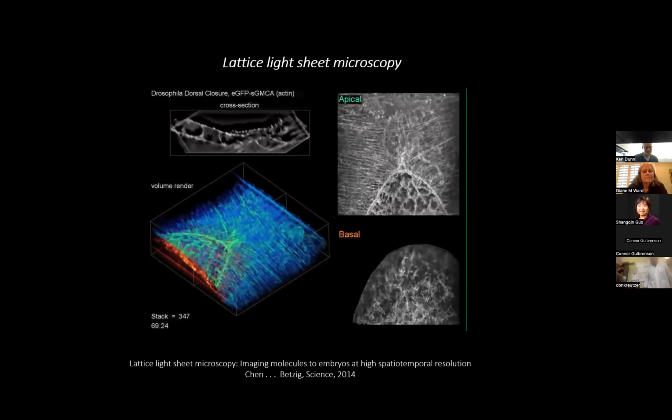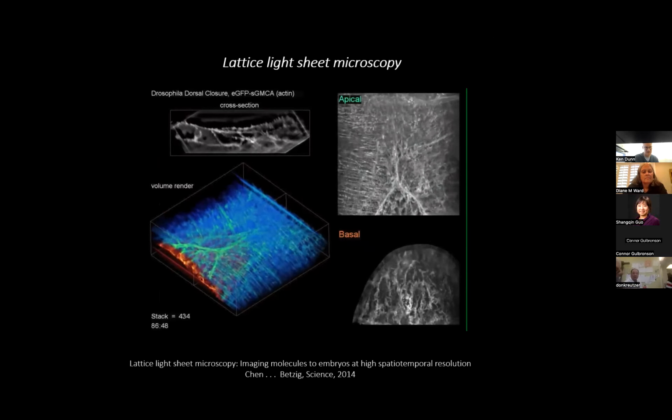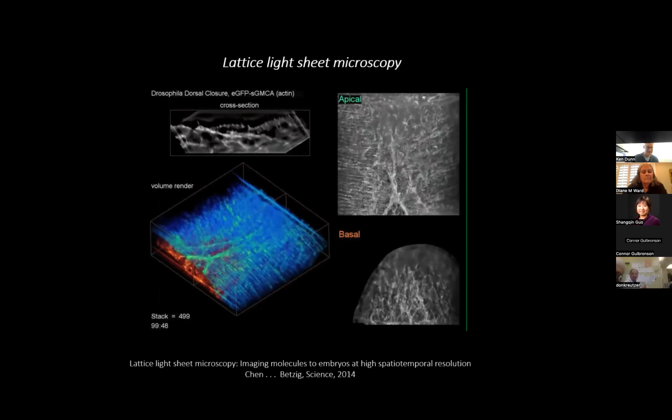And it's pretty astonishing. Not only is it fast enough to collect this data in 3D, it is fast enough that you're not actually seeing any photobleaching damage from it either. I had a third example, but I got rid of it. I recommend that you go find this paper and download the movies because they are jaw-dropping, and there are more of them.